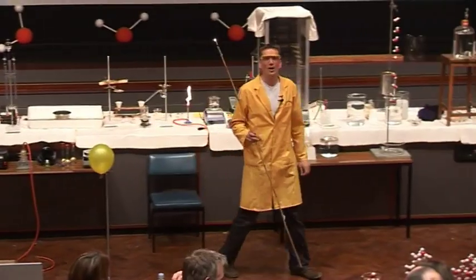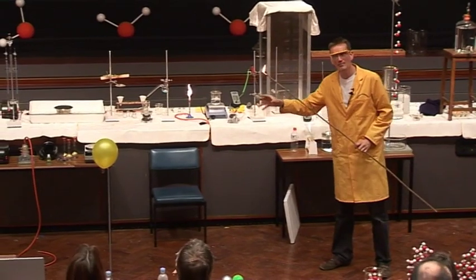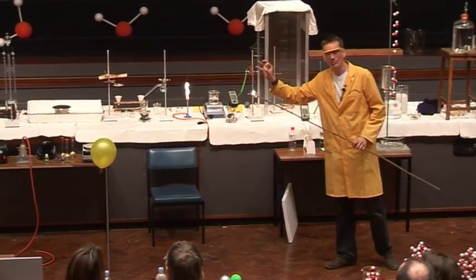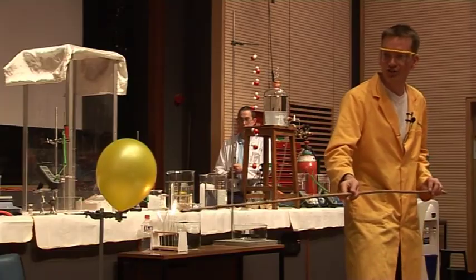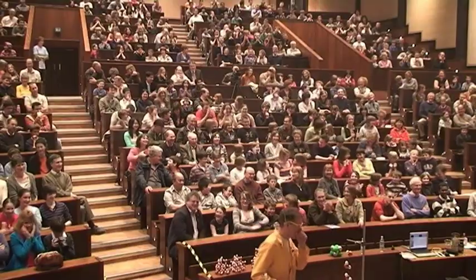And we know that this is right because the chemical formula for water is H2O. That means each molecule contains 2 atoms of hydrogen, 1 atom of oxygen. So that's the best ratio to mix them. Well, let's try this one then. This is 2 parts hydrogen, 1 part oxygen. And that was pretty loud.